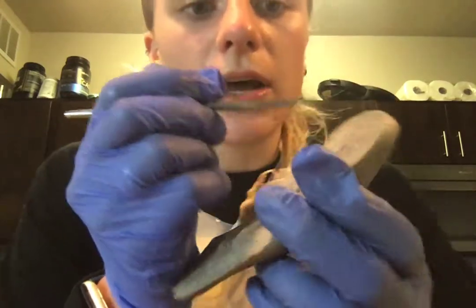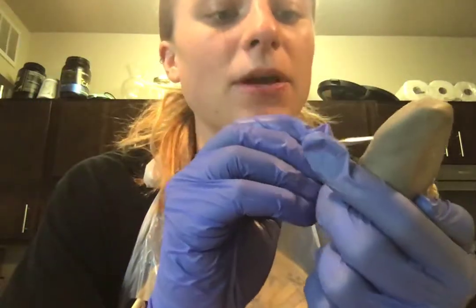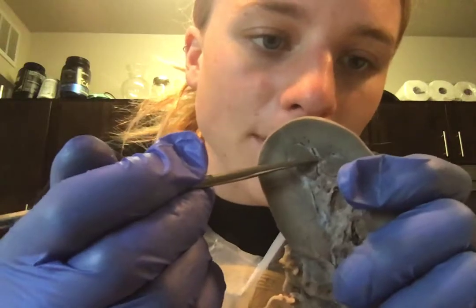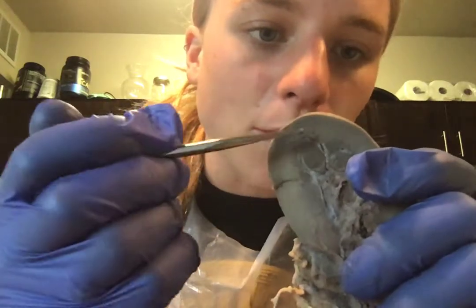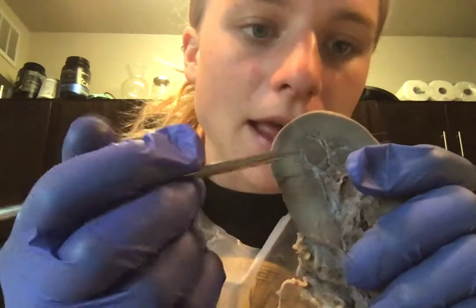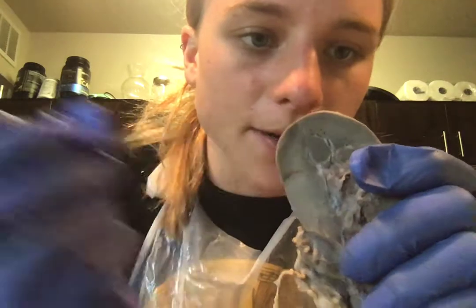So the renal medulla is going to be divided into pyramids, renal pyramids. So if we look closely here, this is a renal pyramid right here with the base bordering the renal cortex. And the tip is right here. So we can see the tip of the pyramid is right here.